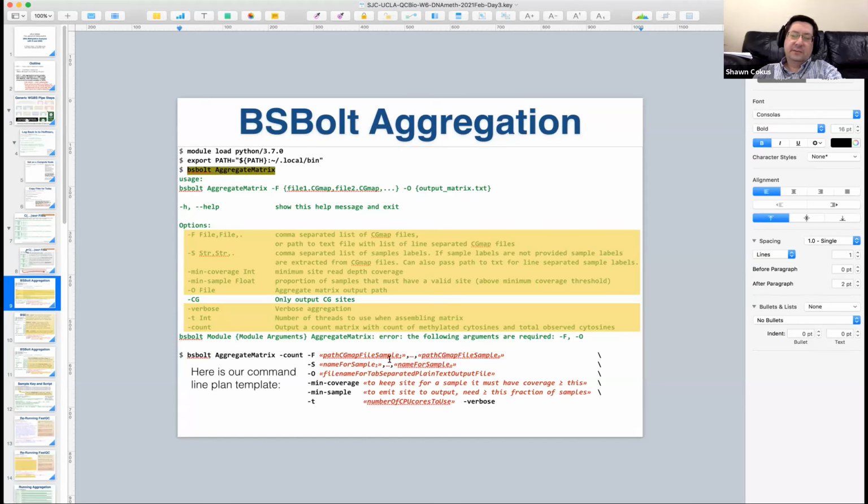Because they're going to turn into column names in the output file, and we're probably going to read that with R and stuff. You don't want to get too crazy with weird characters in those, or even white space probably, and so on. It's just going to make your life hard. So we'll keep those simple.